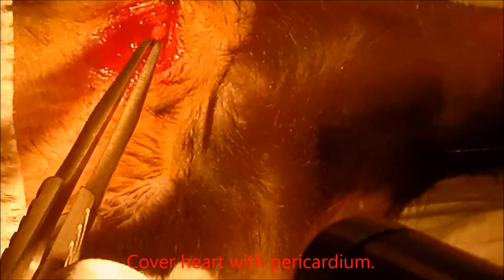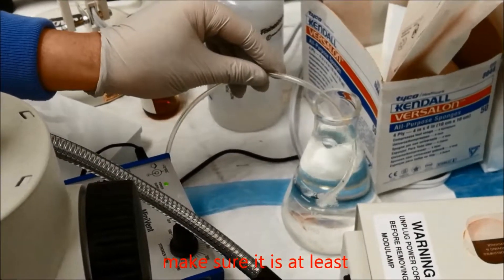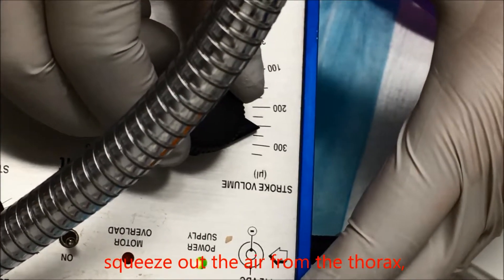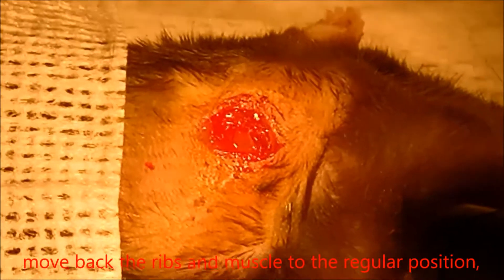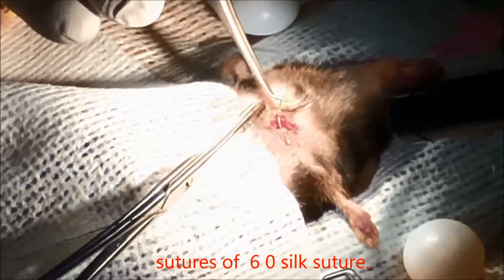Cover the heart with the pericardium. Put the outlet of the ventilator tube back into water, ensuring it is at least 5 cm below the water surface. Increase the ventilator tidal volume by 25 to 50 microliters to allow the mouse lung to expand enough to squeeze out the air from the thorax, and gently press the mouse chest to help expel air. Move the ribs and muscle back to the regular position, cover the thorax wound with the pectoralis major and minor muscles, and close the skin wound with 4 to 5 sutures of 6-0 silk suture.